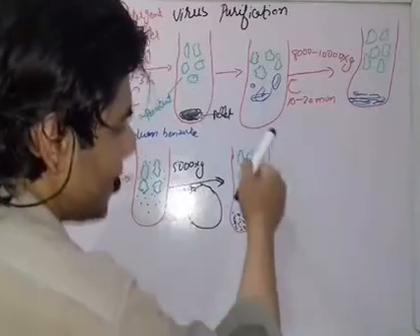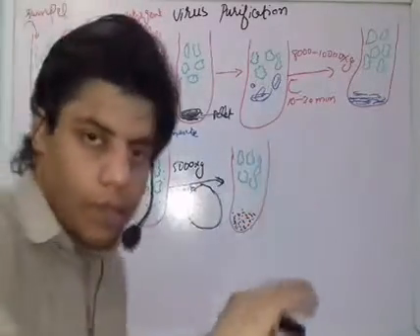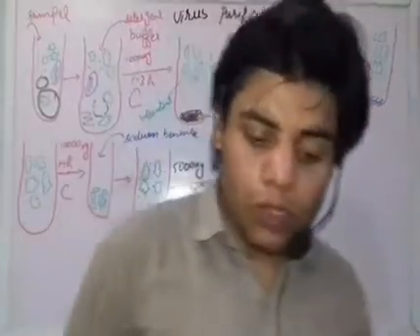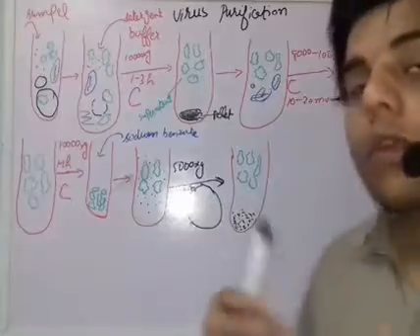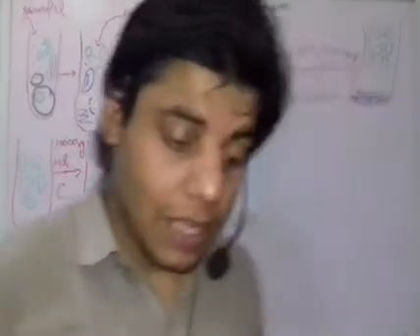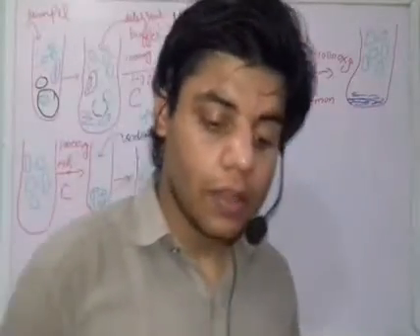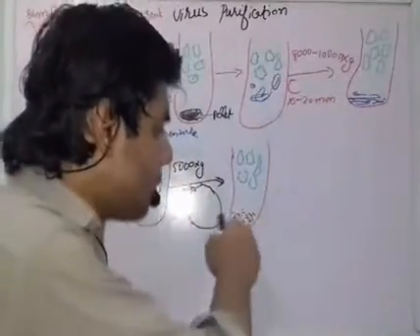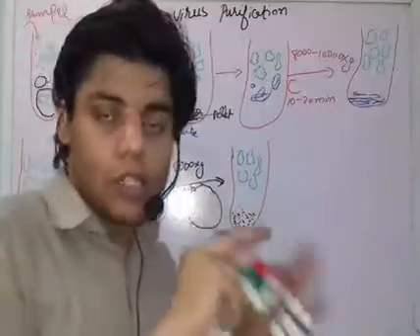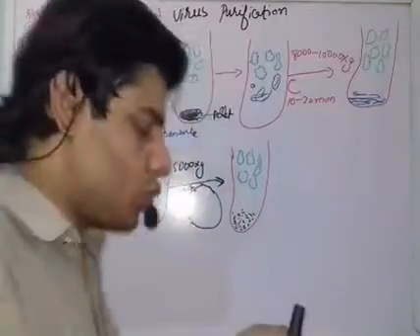These are the debris and these are the viruses in a supernatant form. After that, we eliminate this debris from the tubes, and then we load sucrose solution.